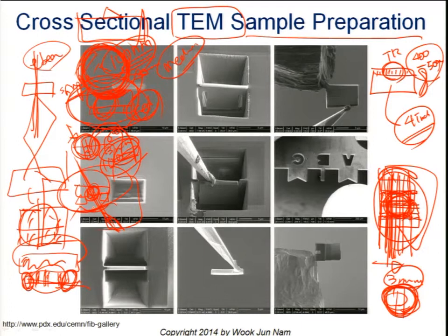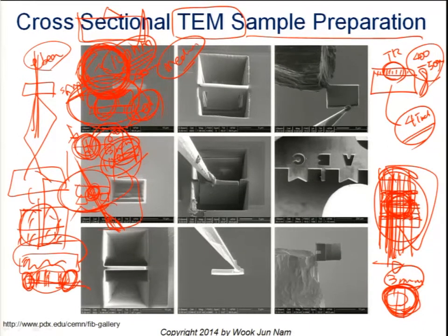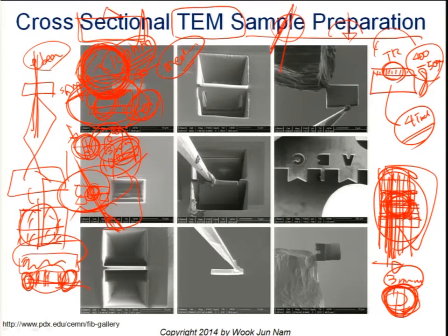But even for that, the transistor structures nowadays, the entire structure is smaller than 100 nanometers. So at some point, we cannot find the target in those samples. We spend that much time, and it does not cut the right place. If this is a dome structure and we want to cut the center of the dome, it could be cutting a little bit shifted or totally shifted.